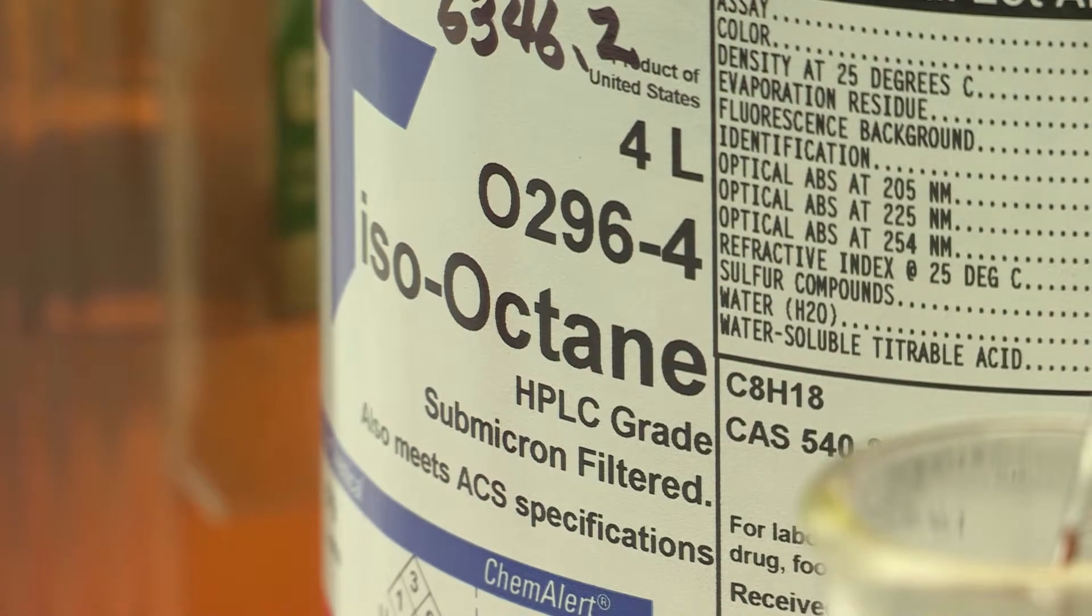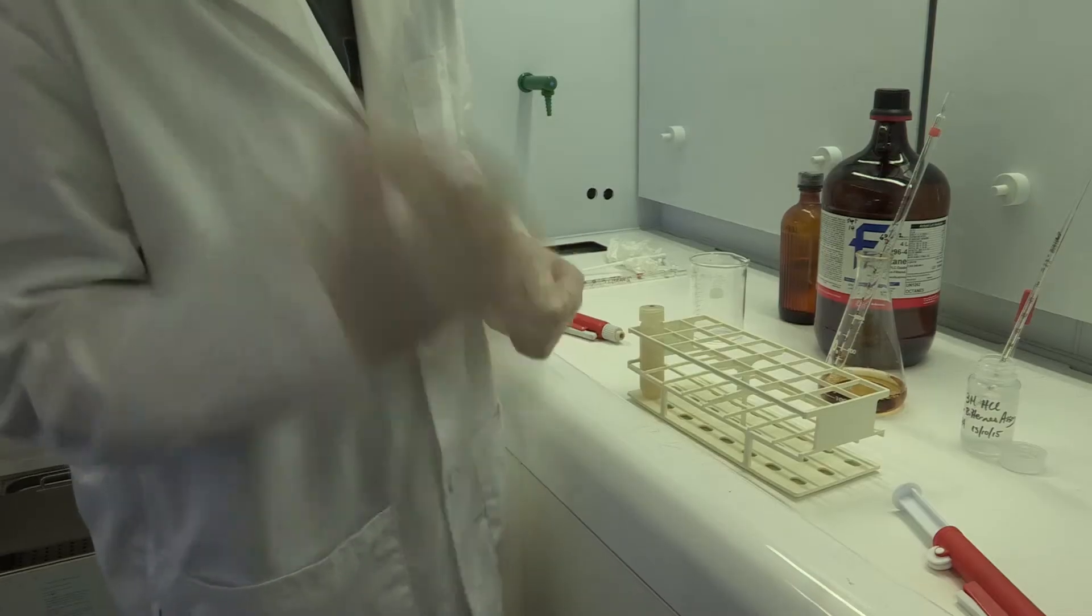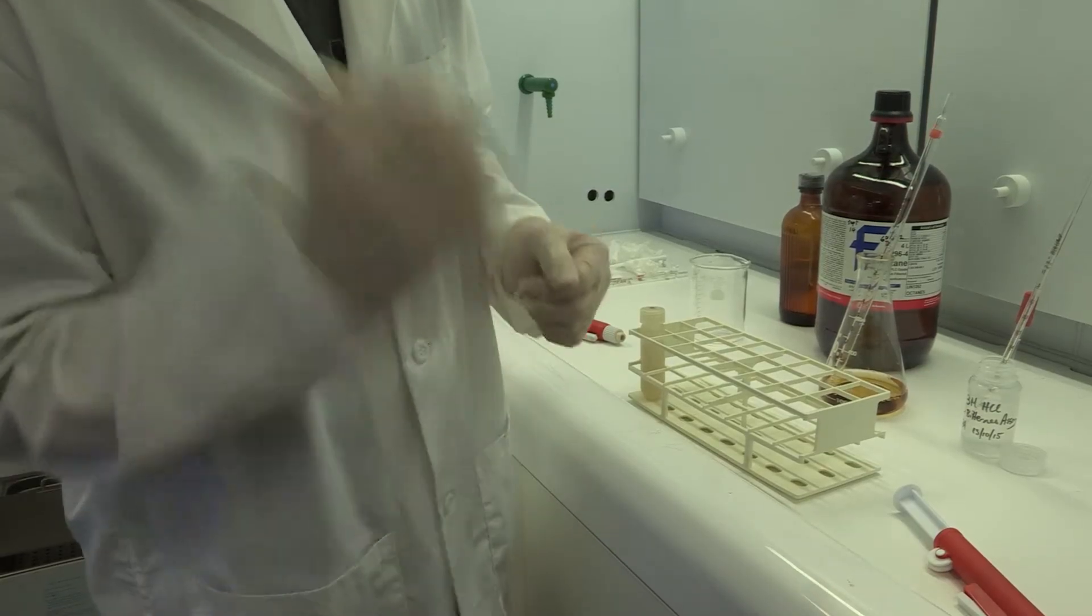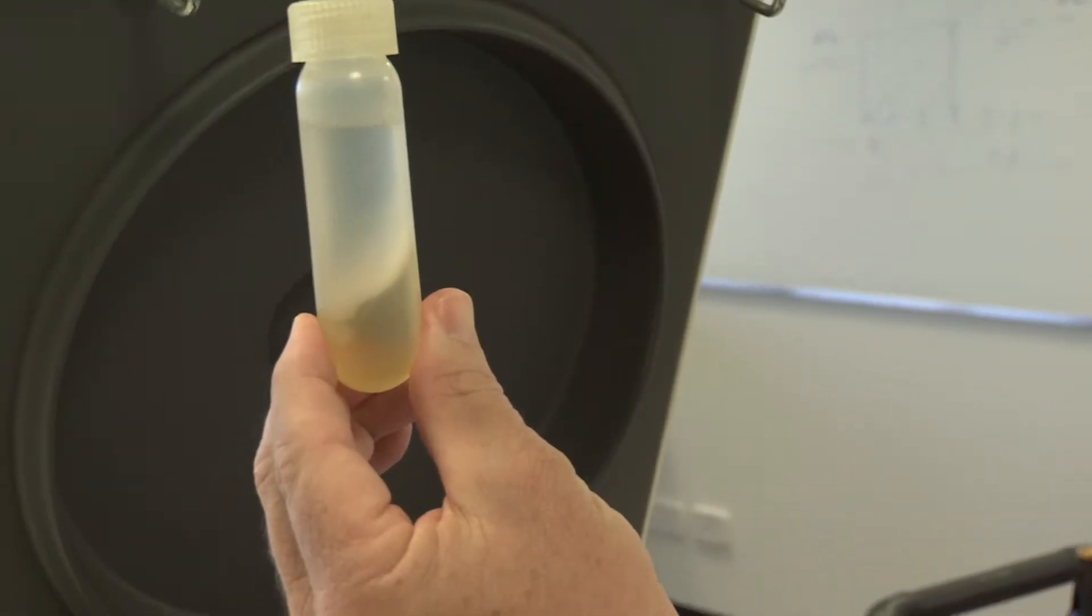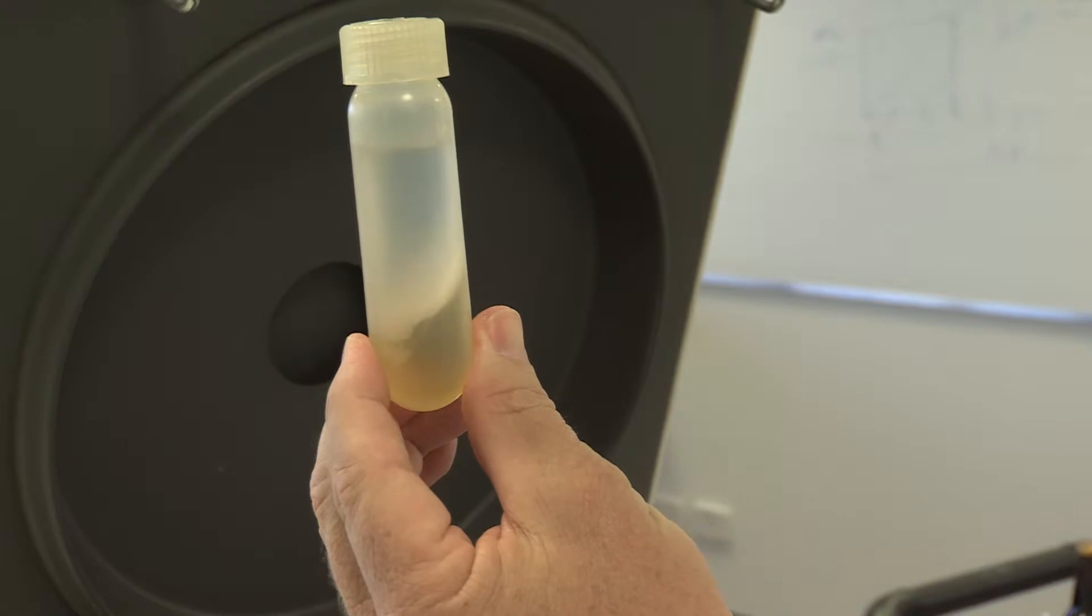Then 20ml of iso-octane is added and the tube vigorously shaken. The iso-alpha acids are more soluble in iso-octane than the aqueous phase, so they're extracted into the iso-octane.